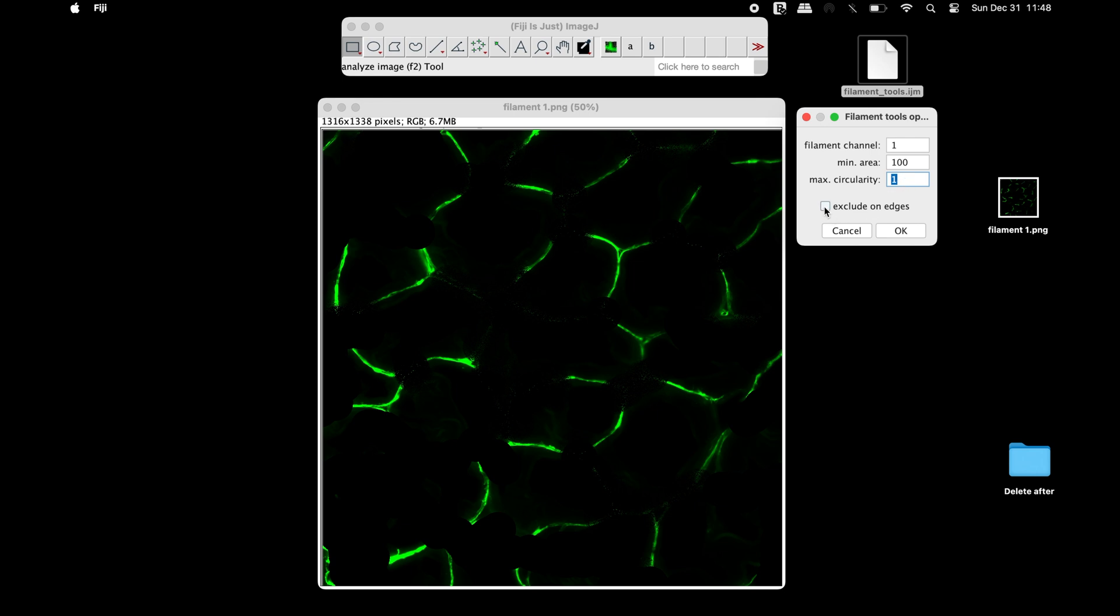Select the option exclude on edges if the filaments on edges of the images are to be excluded. Once all the parameters are set, click OK.